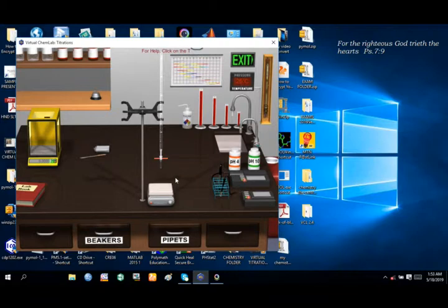This video can be of help to the National Open University system, where they can conduct chemistry practicals directly from the internet or online. In this video, we are going to, as I've said, conduct an acid-base titration.